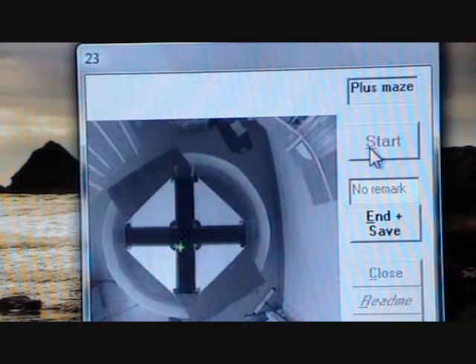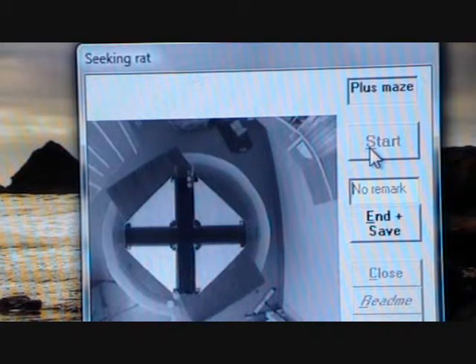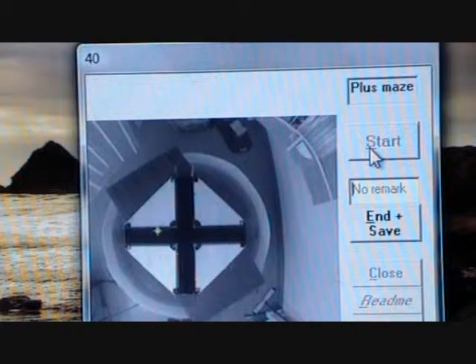Here, oh, now we got 2 rats going, there we go. So you can see that the ping pong ball is being tracked quite nicely. I'm pushing it relatively fast, so it's moving quite well between these 2 arms from the north to the south. So west to east, and it still is tracking nicely.